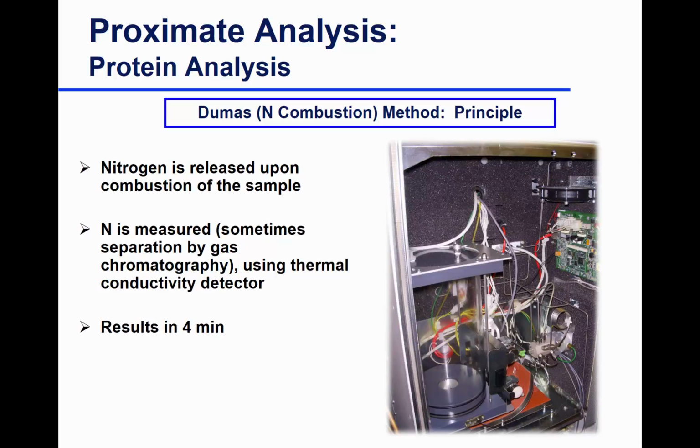So from there, after the samples combusted, once again as a recap, they went into the ballast. And in the ballast, our combustion reaction products, so our nitrous oxides and our CO2, were mixed with the help of oxygen. So oxygen is what helped mix the samples in the ballast. And then an aliquot was taken using the aliquot loop. There again, just like in GC, we don't need to send the whole amount of sample to the detector, so we can take a smaller amount.